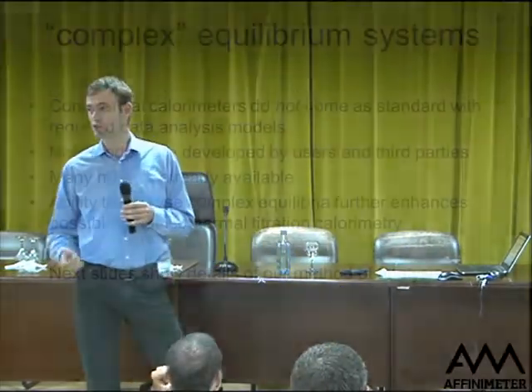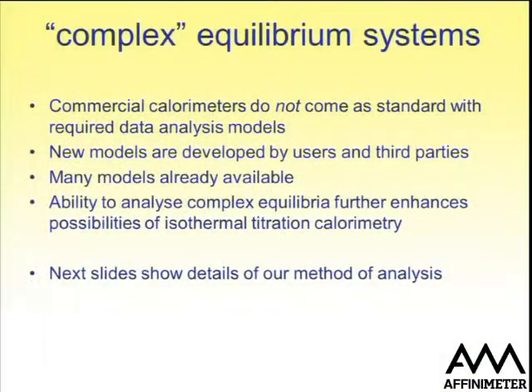But the good news is that the ability to analyze more complex data actually allows you to really unleash the power of isothermal titration calorimetry. A lot of models are now available. We've already seen in Adrian's presentation the analysis models in terms of the binding polynomial, and I hope to show you a few more in the next few minutes.